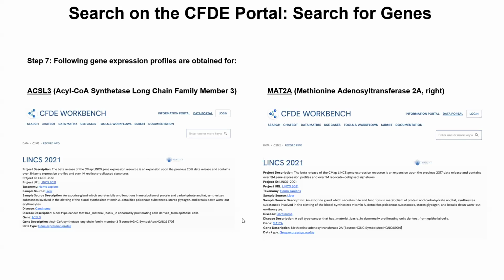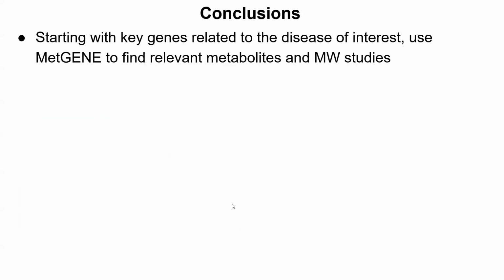So what we see here is that on the data portal, we can find a rich set of information which we can further explore. And in some cases, we will be able to download data files and we can further analyze the data files using suitable tools. So with this, I would like to conclude the demonstration.